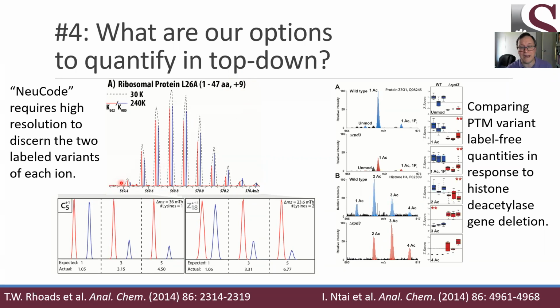Within that, we have an isotopic packet where the isotopes are spaced every 1/9 of an m/z. And because the instruments we can use today have such amazing resolution, we are able to distinguish not only one isotope from the next, but the light lysines from the heavy hydrogen-labeled lysines. I think that's kind of astonishing, frankly. But in this case, we know that this intensity can be compared to that intensity. These are very, very closely paired.